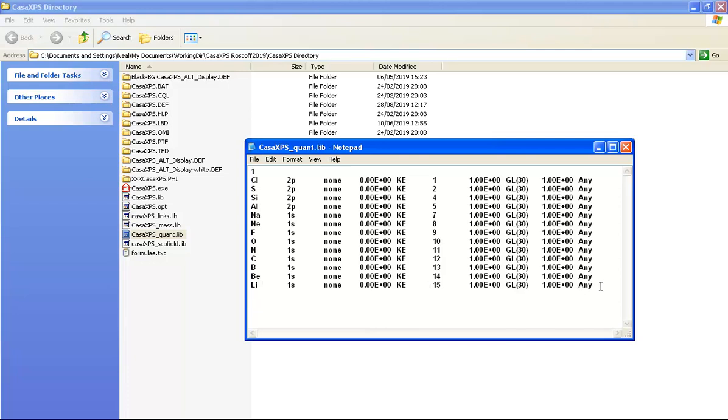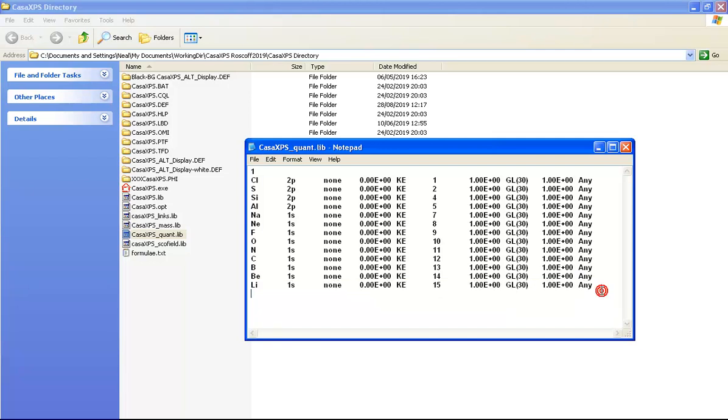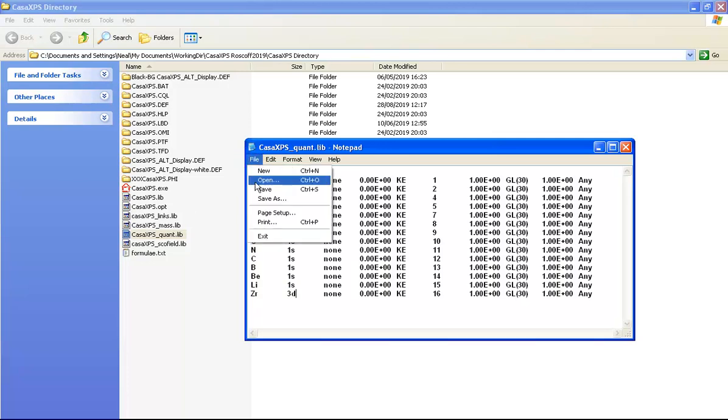These can be added to change the behavior of how the create region button behaves. For example, I could add another entry and make this entry zirconium and specify that I would like to use 3d.